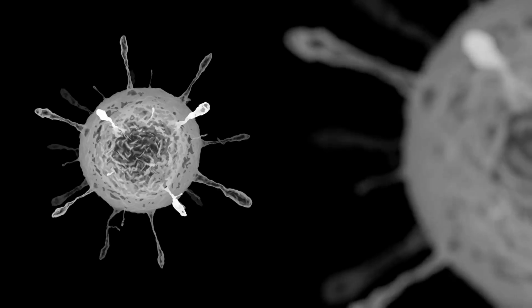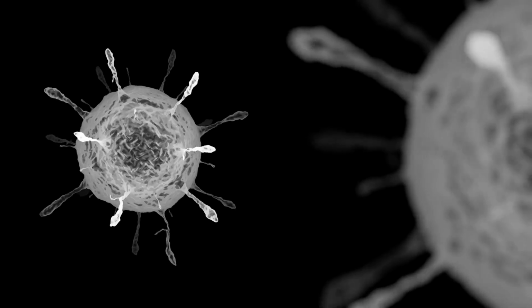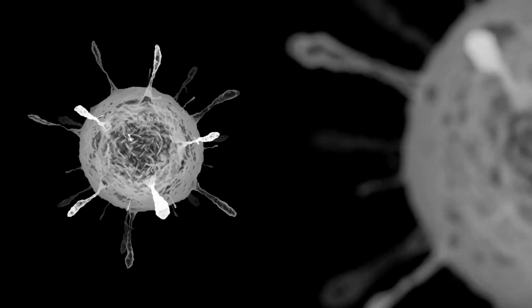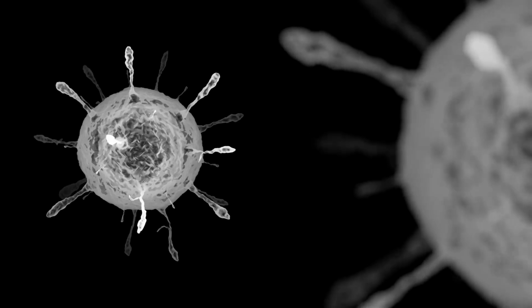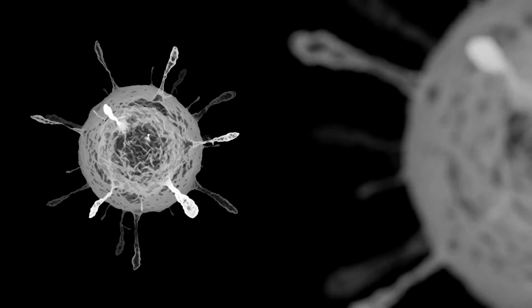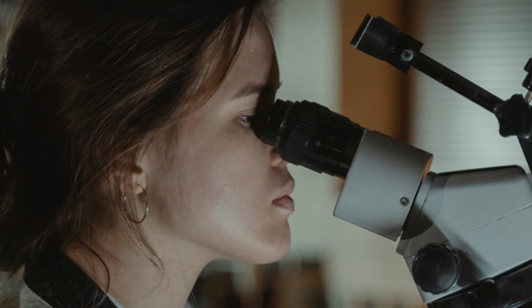To make certain parts of the cell easier to see, scientists often use stains. These are special dyes that stick to specific structures, like the cell's nucleus or its outer wall, making them stand out with color. This helps us identify different parts of the cell and understand what they do inside a living organism. Section 3. Under the beam, the power of electron microscopes.